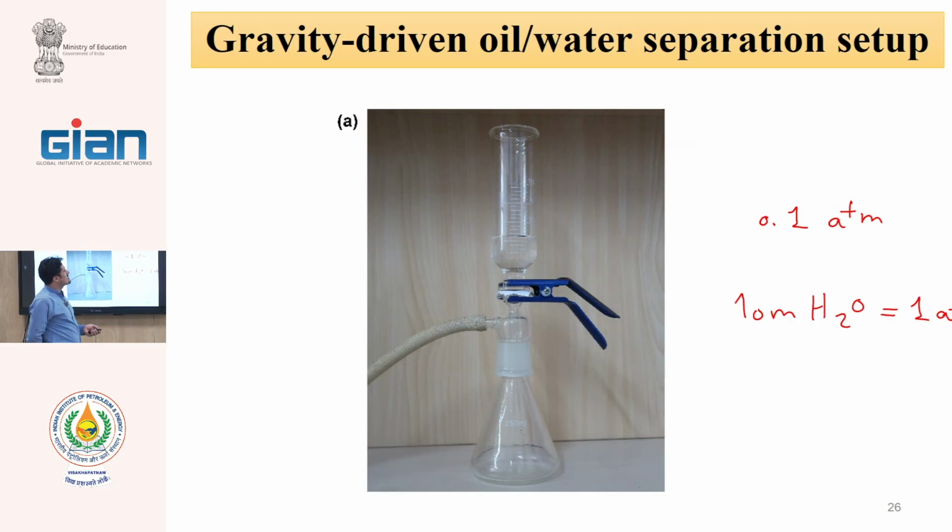For testing of this, we usually have a similar setup. If we need a little vacuum pressure, this can be connected to the vacuum also, if we want to apply very low pressure. Membranes are located here. This section separates from the membrane located here. You see this membrane, and this clamp keeps the membranes.